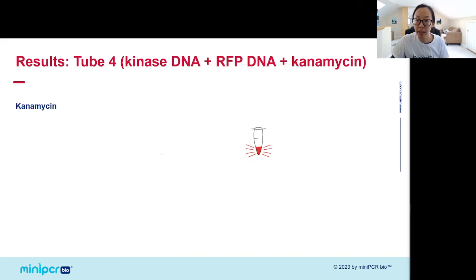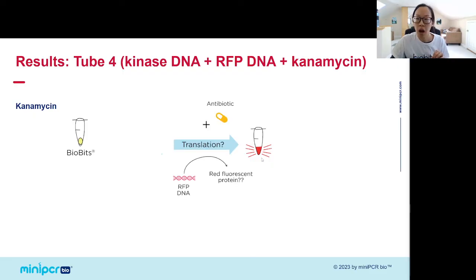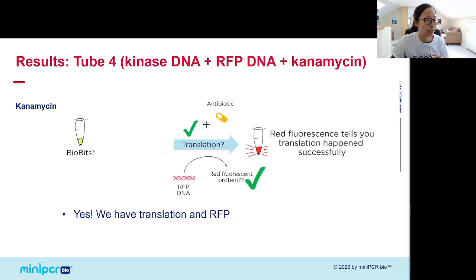On the other hand, in the tube 4 of the lab group that did use kanamycin, we do see RFP. So this tells us that, yes, translation did work and protein synthesis did happen to make the RFP that we can see.